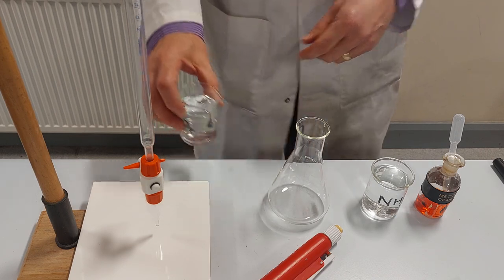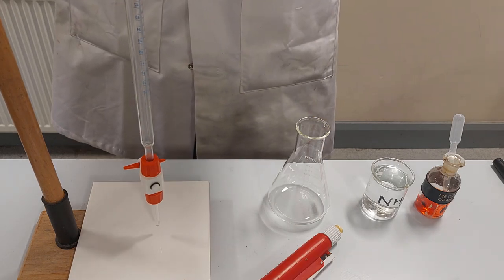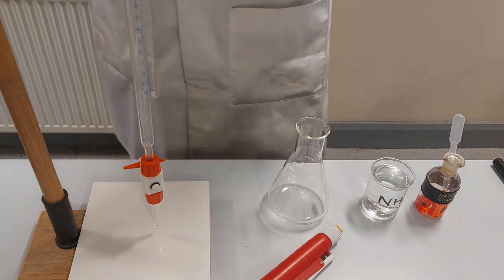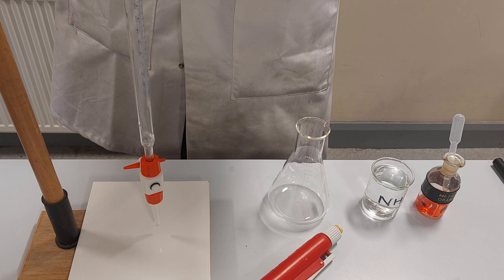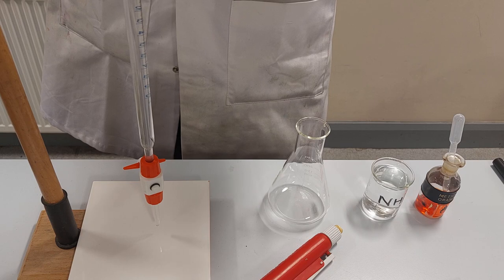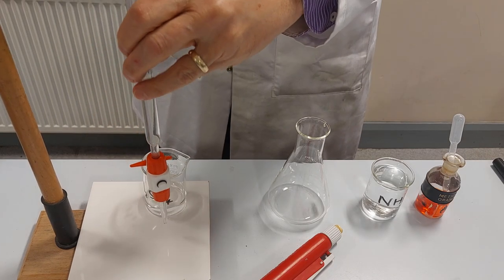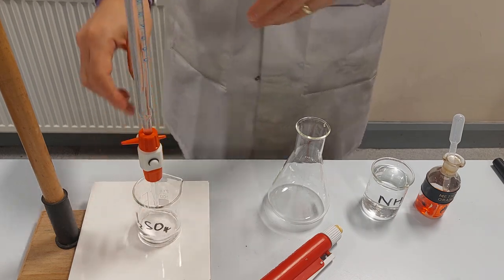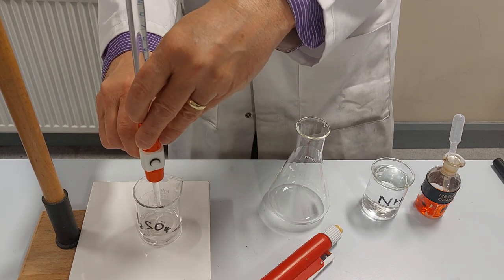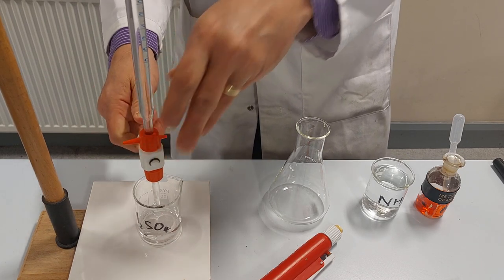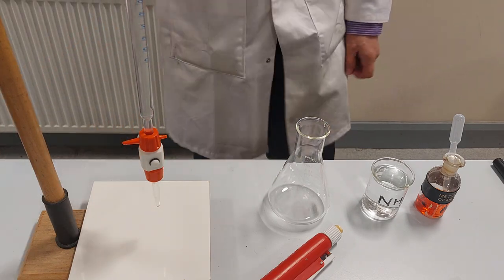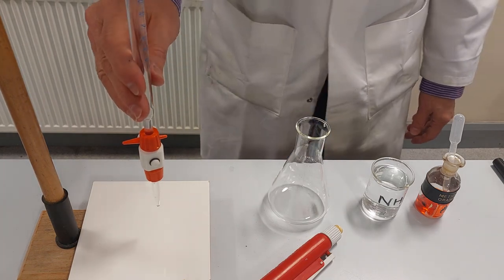I'm going to put the sulfuric acid first of all in this tall piece of apparatus here which is called a burette. I'm going to fill that right to the top, and then I'm going to run a bit through this jet here knocking out any air bubbles that appear, and then that's just going to be sitting right on zero on the scale at the top there. So that's my burette full of acid all ready to go.